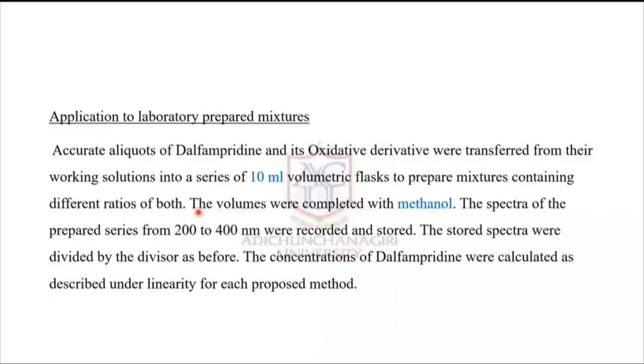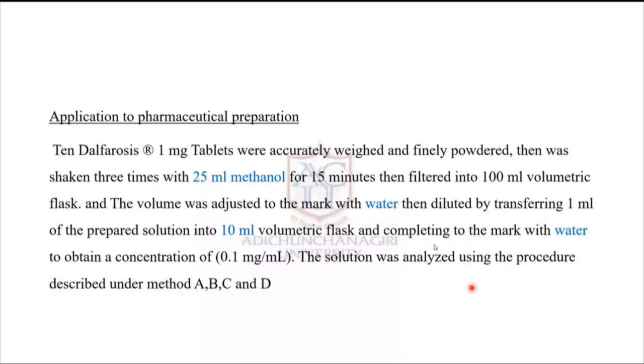And then the same thing was applied for pharmaceutical preparation also. So the 10 tablets were taken, and the same procedure was applied by using methanol as a solvent, and finally the volume was made with water. So different concentrations were prepared and analyzed. And these are the validation parameters done, and the statistical assessment was also done.